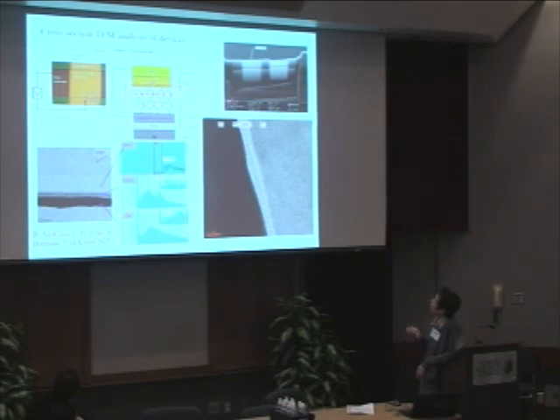The sample is prepared by FIB, shown here with the dual column system. Here is the TEM image of this particular region. The silicon is the substrate, and their molecular layer is only about 4 or 5 nanometers.